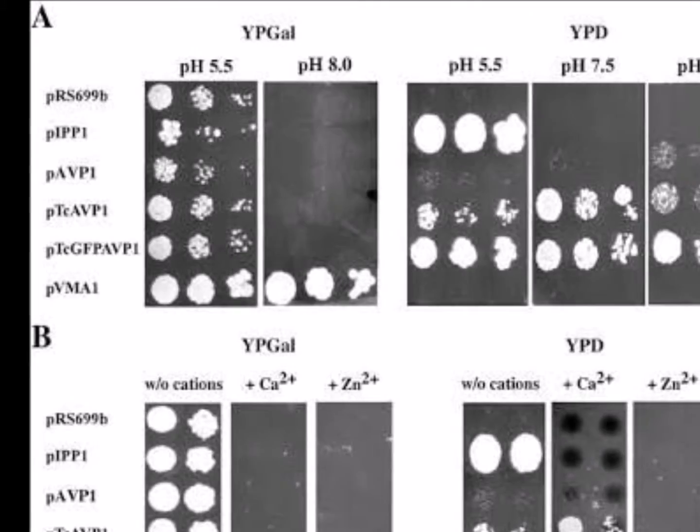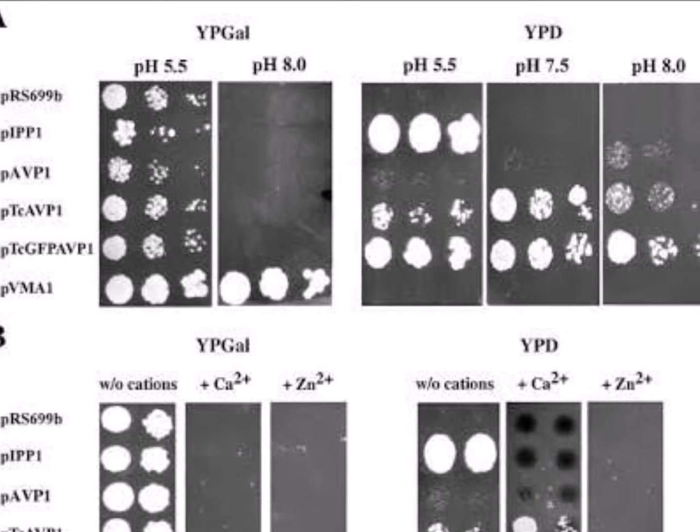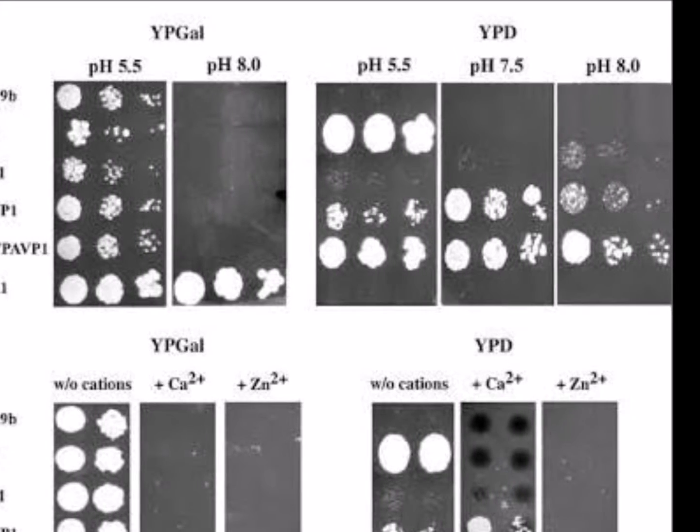Alkali cations, a method used especially with intact yeast cells, which are treated with alkali cations to take up plasmid DNA. The most used cations are of lithium, cesium, and sodium.